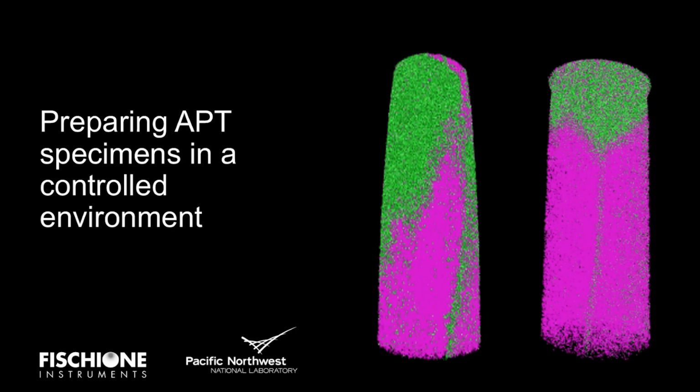Already deformation will reduce your EBSD pattern quality, because heavily deformed material will give fuzzy patterns because there is less crystalline material. So if you add oxidation on top of that, the signal will be much weaker, and you will lose your accuracy of indexing and interpretation after.